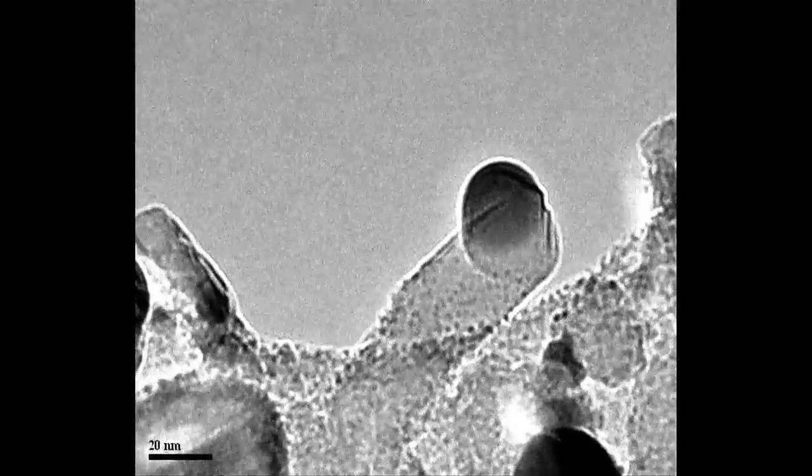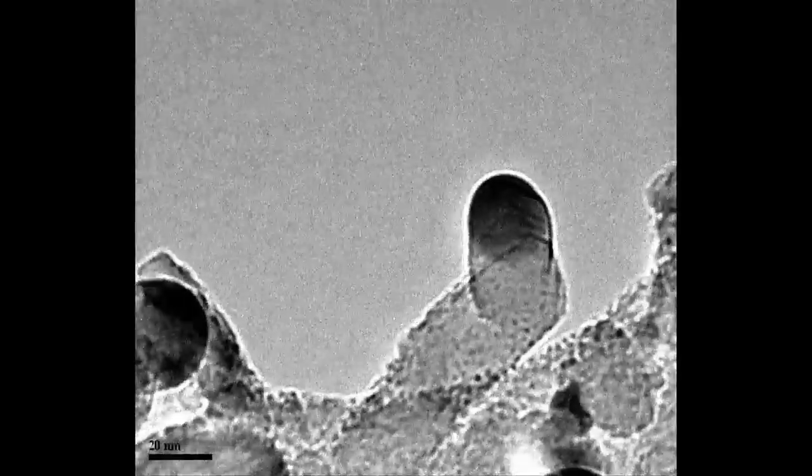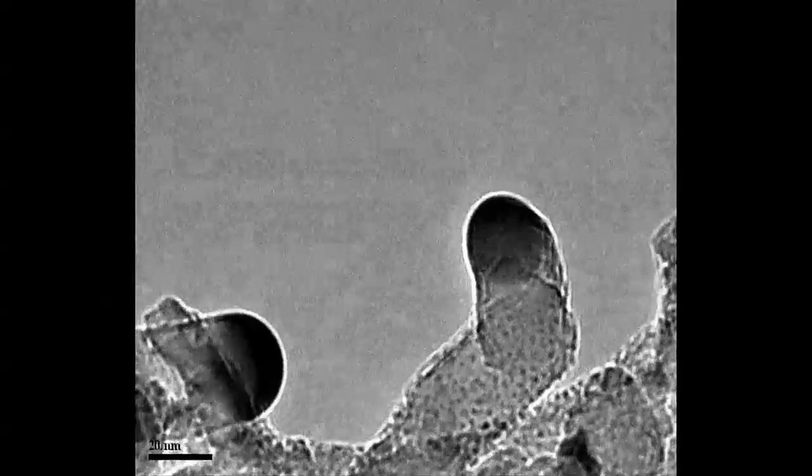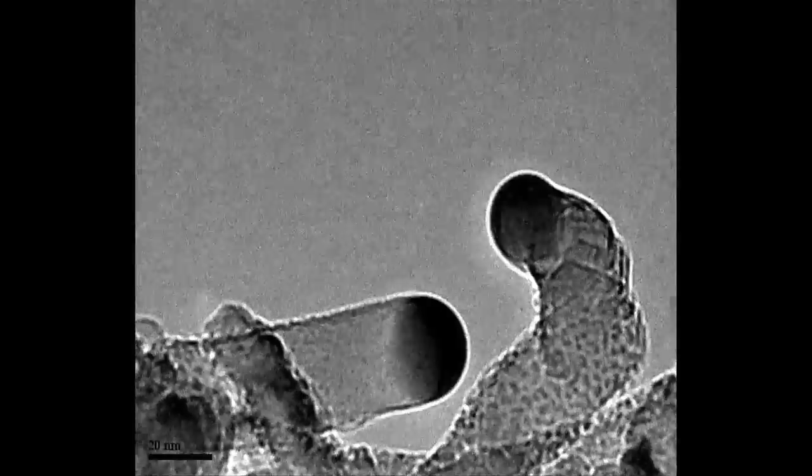You are watching an electron microscope video of silicon nanowires growing from gold particles. A nanowire is a pillar of crystal ranging from a few to several thousand atoms in diameter.